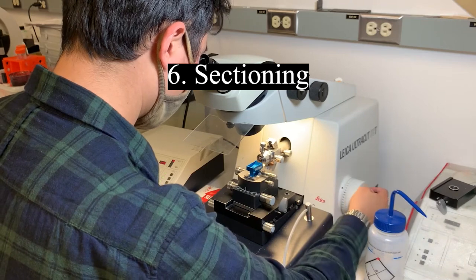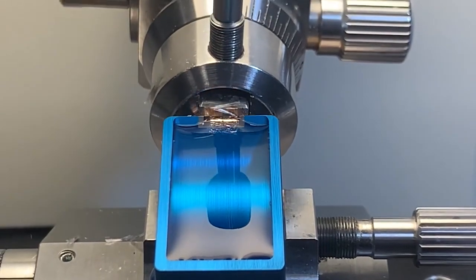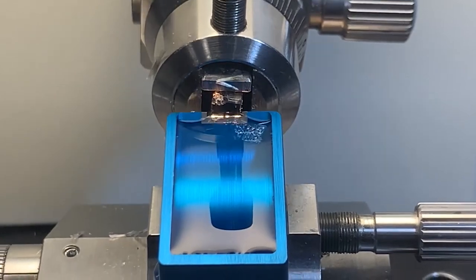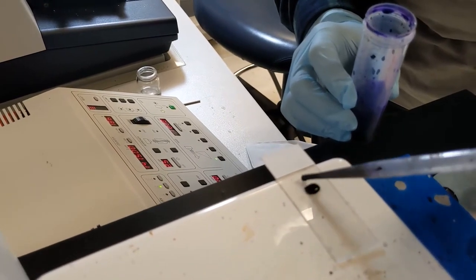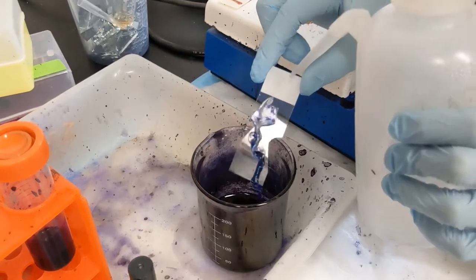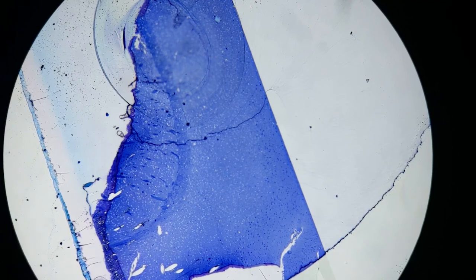Using a glass or diamond knife, we take semi-thin 500 nanometer sections from the surface of the embedded tissue with an ultramicrotome. Periodically, survey sections are mounted onto a glass slide and dyed with the cationic stain toluidine blue. This allows for visualization of proteins at a high pH, and observation with the light microscope allows us to confirm sectioning depth as we approach our area of interest.